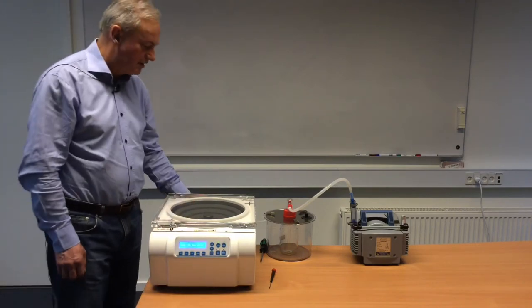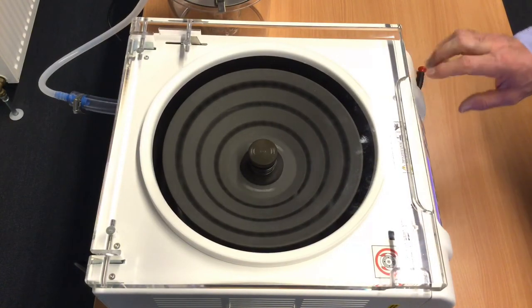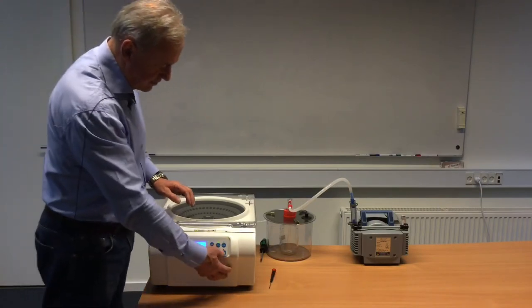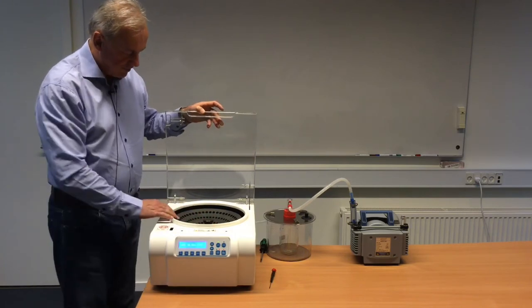At the same time, it will release the pressure back to atmospheric pressure. There will be a small alarm telling you that the rotation has stopped and that the unit is ready to open the lid. Press the button and we can open the lid, take out the samples, and get everything working normally.